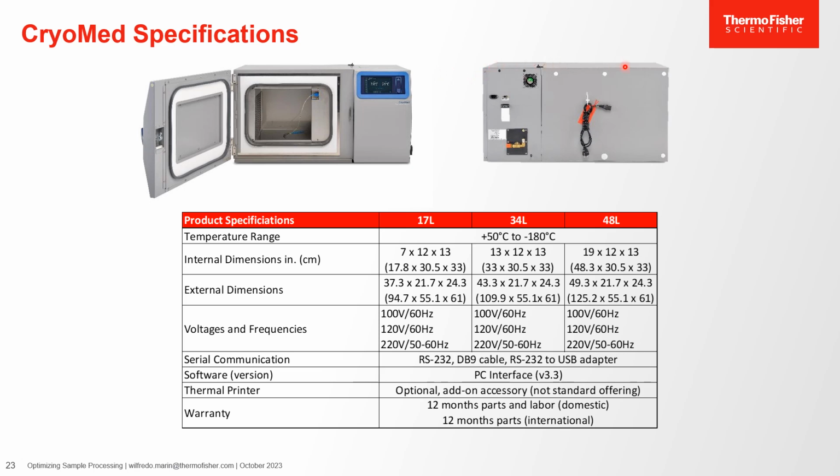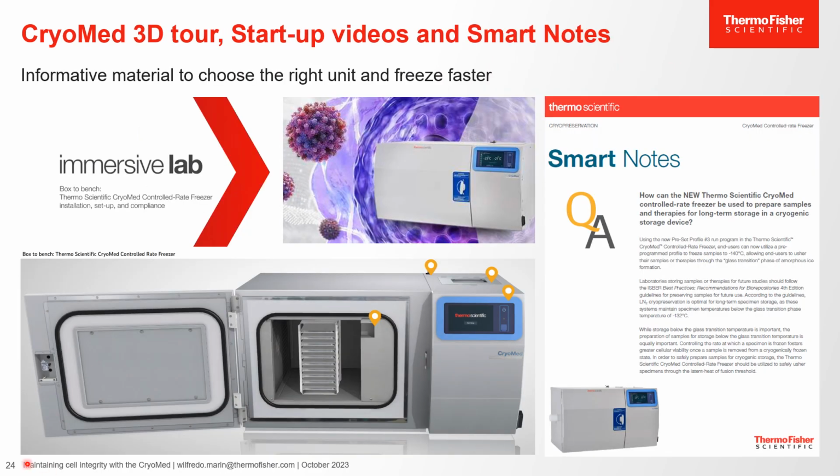If you have additional questions, we have videos that I believe are now posted on YouTube. So three great ones. One would be a box to bench, a preventative maintenance, and then I contributed to one discussing the different connectivity options, so Wi-Fi as well as that RS-232. And then a third one that I'll sort of allude to in these next couple slides. But definitely make sure you check out those short videos, maybe 5-6 minutes.